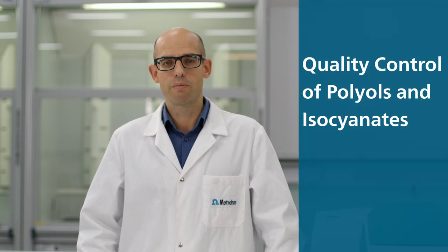Do you want to save time and money when performing quality control of polyols and isocyanates? Hi, I'm Nicholas and in this video I will show you how to accomplish this easily with near-infrared spectroscopy using the DS2500 liquid analyzer from Metrohm.